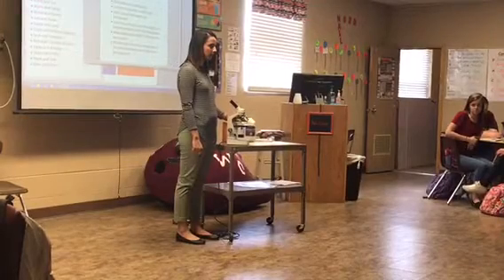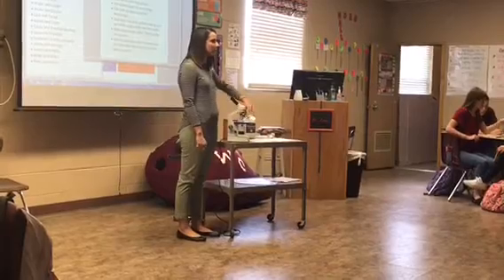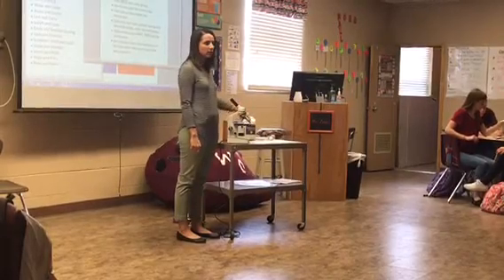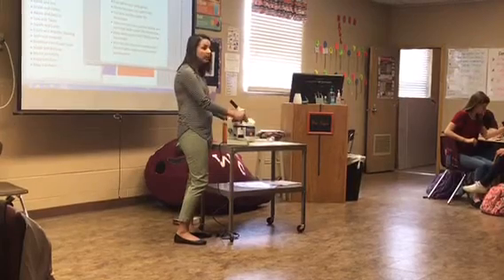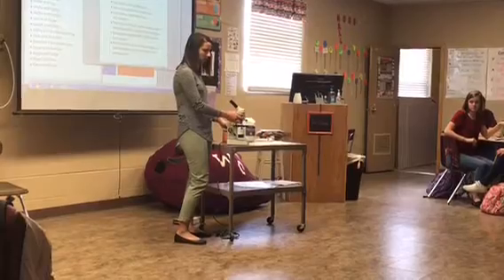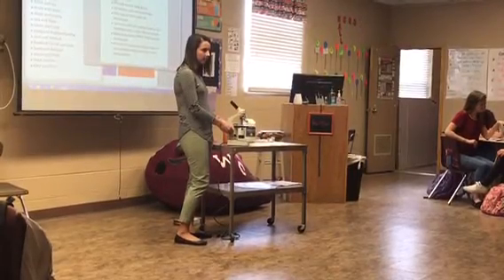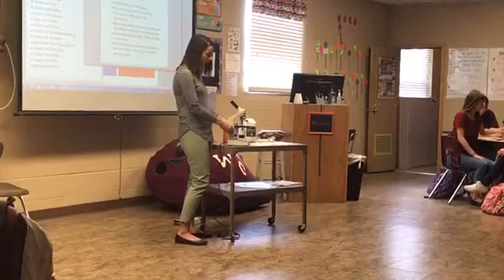Then we're going to move to medium and high. You may only need low and medium to get your observations. But if you are going to use the high objective, do not use the coarse adjustment knob on the high, because it will crush the microscope, or the slide.